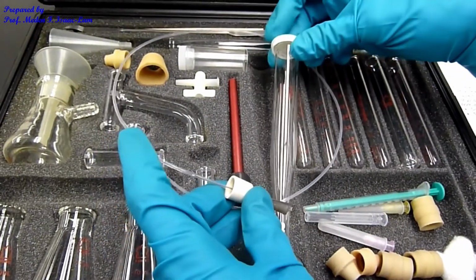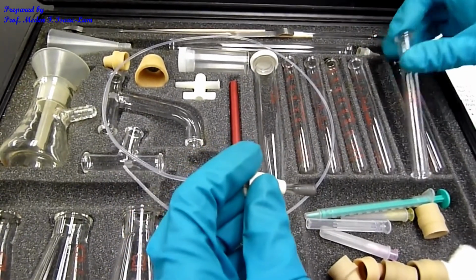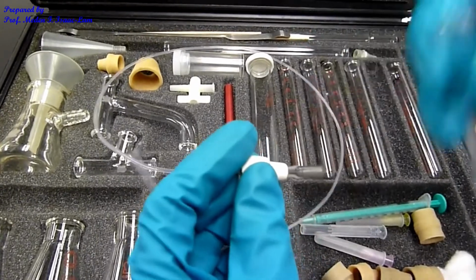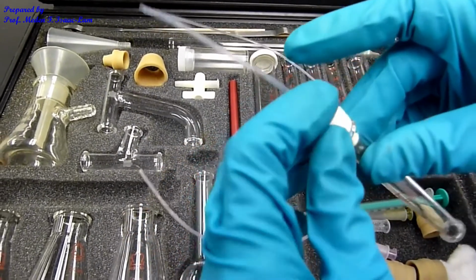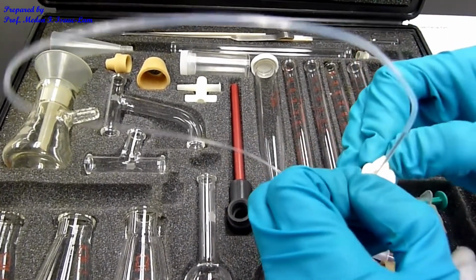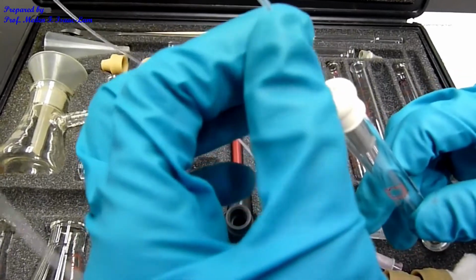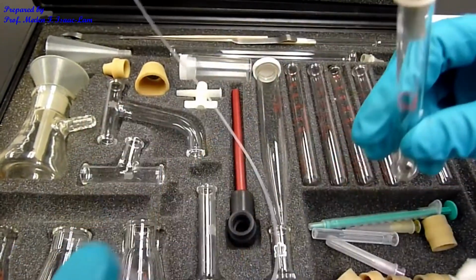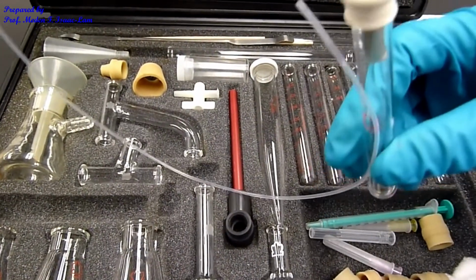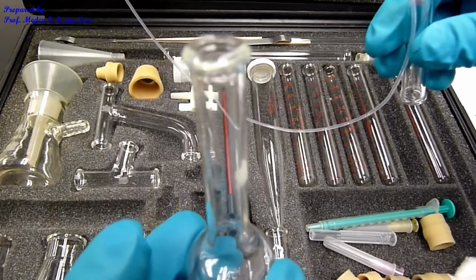And then I'm going to put it, this is the air condenser, and I'm going to invert it. So that is our setup. Okay? So I will put this on top of the RBF.